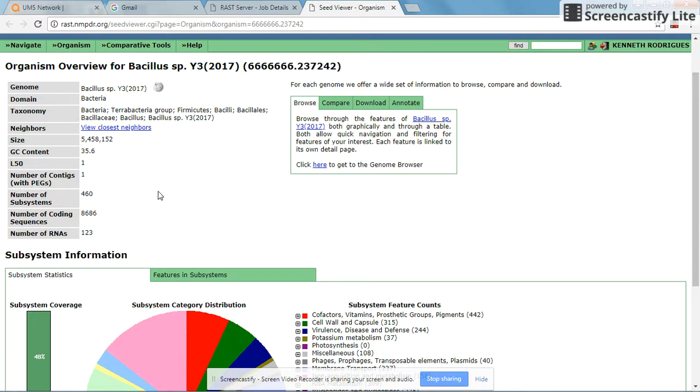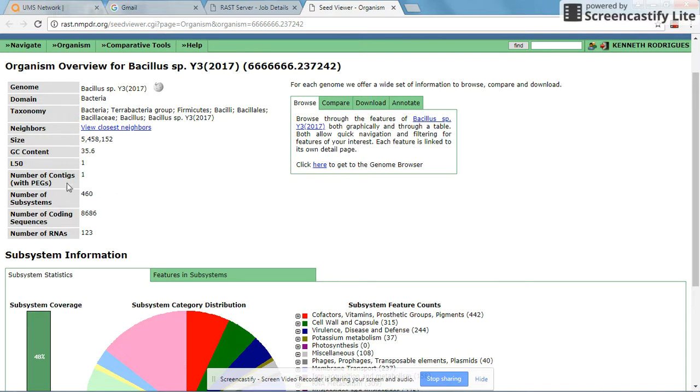This gives an indication that your genome sequencing has been successful or adequate. You see your GC content, which is around 35.6, which is also similar to Bacillus species. Our assembly is consisting of one contig.